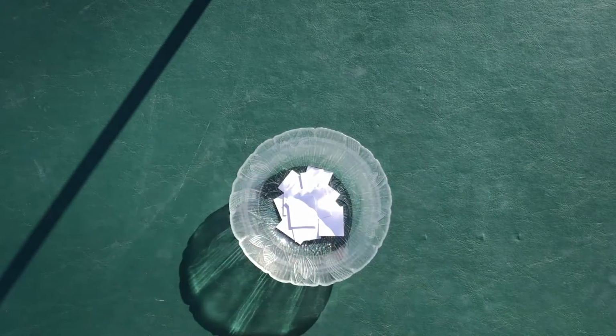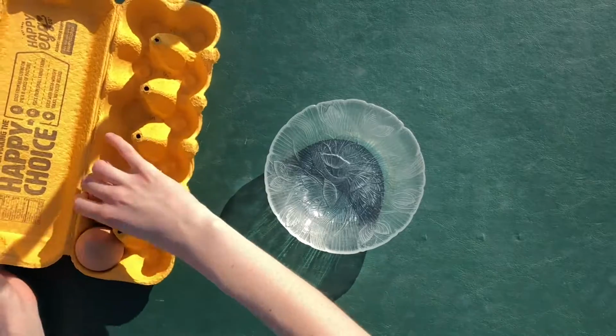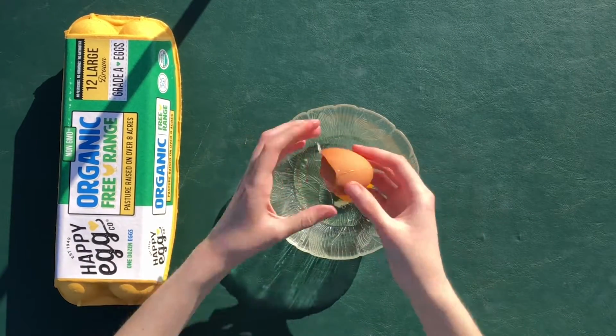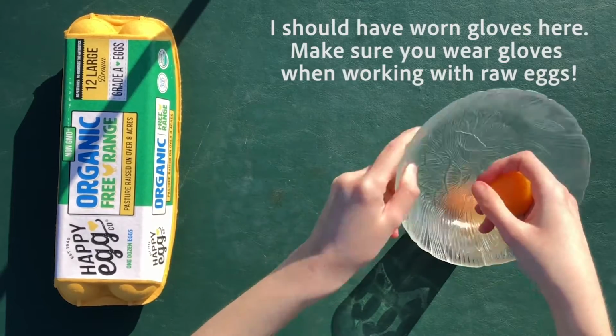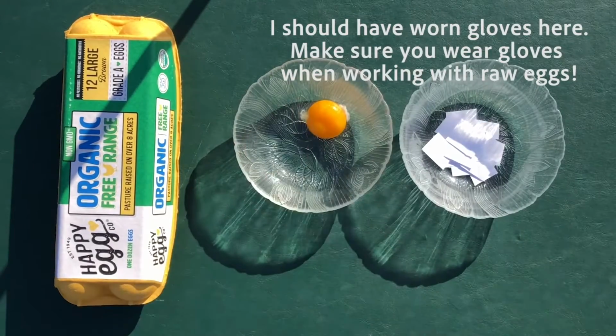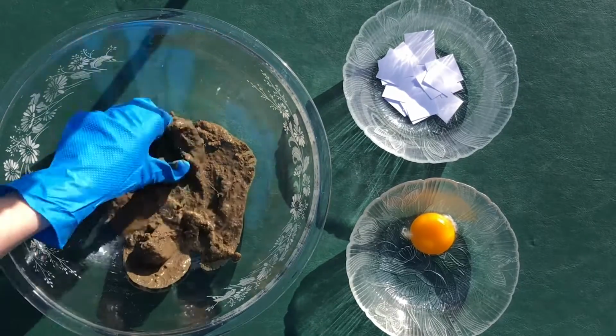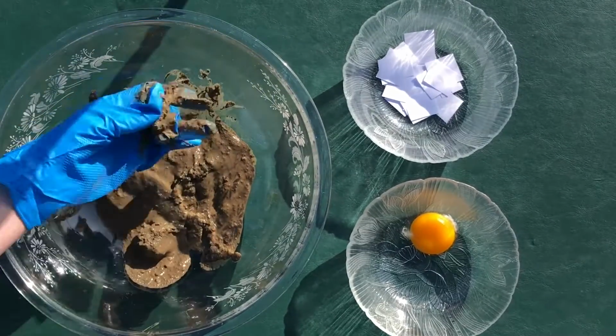The egg will be a source of sulfur and the paper will be a source of carbon. These resources are necessary for the metabolism and survival of some microbes, while other microbes may simply obtain the needed resources from the air or organic matter in the environment itself. Remember to wear gloves when working with mud.